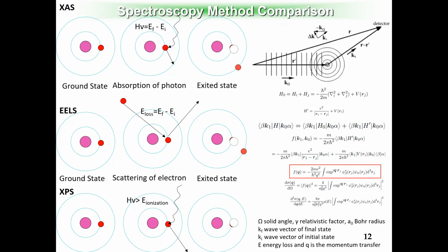So here is the thing. If you go deeper on the XPS, at the instrument level, there is kind of a work function, right? When you test the samples, the instrument level already aligns your work function to the Fermi level of your samples. So if you check your XPS, say lithium 1s, compared with the lithium K-edge in EELS, it's very, very similar. The reason is that the work function is canceled at the instrumental level, right? So if it's canceled, then in both cases what you measured is the difference between the Fermi level and the core electrons. So it will be all the same.